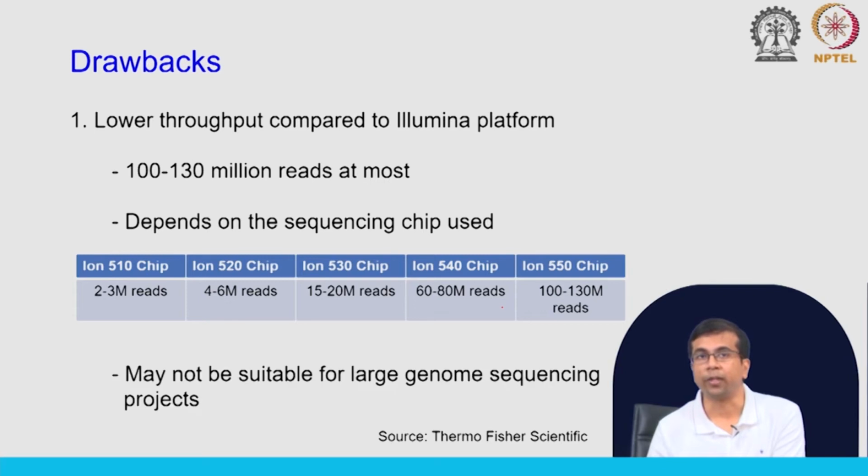So, one of the things you can probably notice is that this is not really suitable for large genome sequencing projects, right. If you want to do, let us say, a huge genome sequencing project for large genomes, you probably would not choose this method. But on the other hand, if you are working with a small number of samples and small genomes, this is probably the ideal and most cost effective method that you can use.